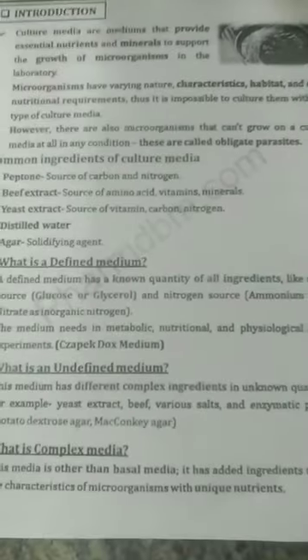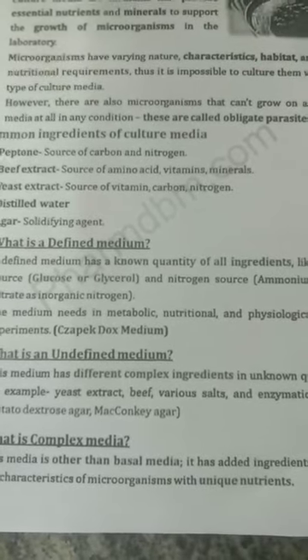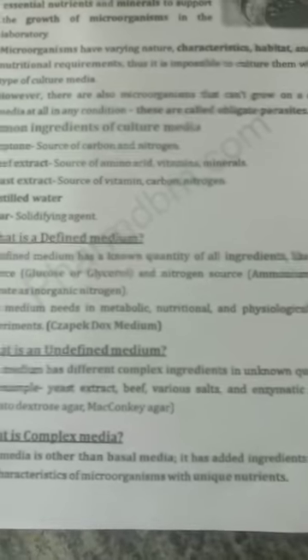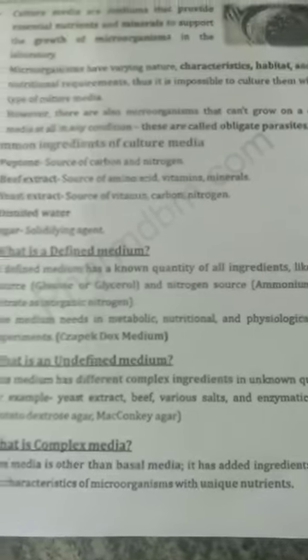Thus it is impossible to culture all microorganisms with one type of culture media. However, there are also microorganisms that cannot grow on culture media under any condition. These are called obligate parasites.